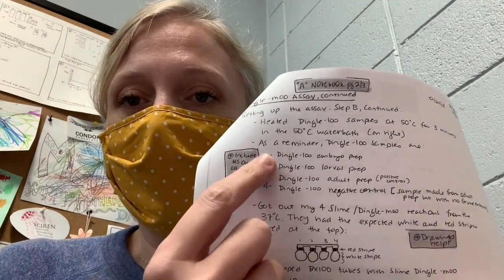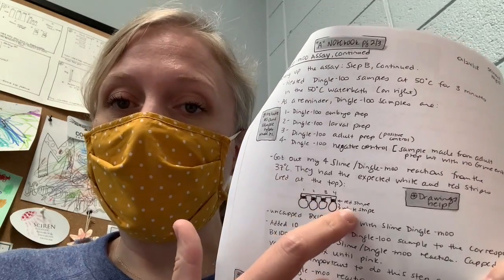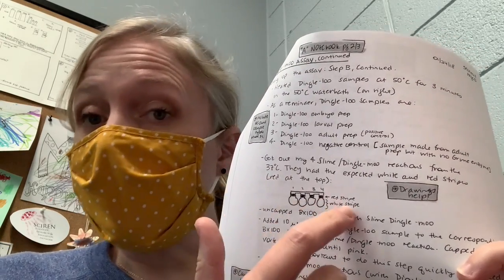There's also a lot of information about samples. So if you have 4 samples, you note what those samples are, especially if they're color-coded in the rest of your notes. You might make drawings of how you set up protocols, especially when you're new to something. I remember when I was just starting out, I would draw a lot of things like how to set up a Western blot or things like that. You can write each step kind of numbered.